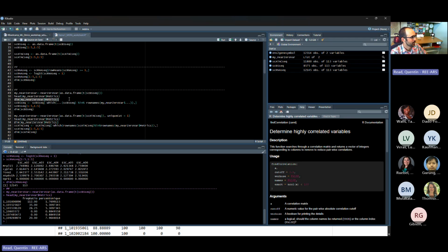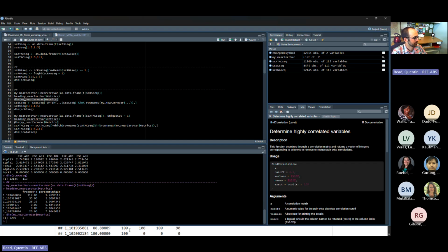And in line 51, we can call dim on that as well to see how many we're getting rid of. All right, so our bisulfite sequence data set has 8,500 rows in it right now. And our filtering step has identified about 3,000 loci that we can say have little variation and we can filter out. So we're actually getting rid of a pretty decent fraction of our loci in this way.